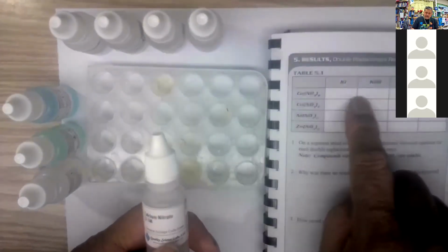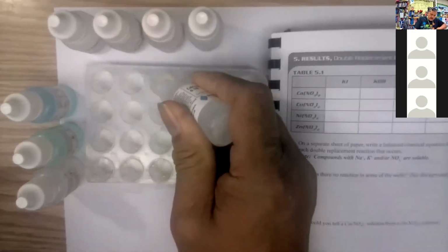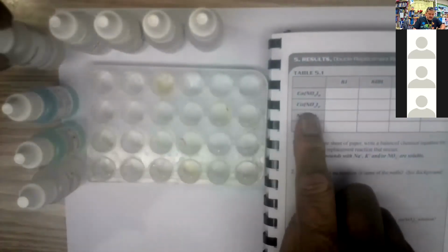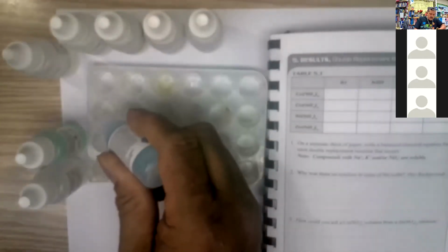All right, so I've got the calcium nitrate. I'm going to put 3 drops going across. Okay, here we go. 1, 2, 3, and so on across the wells. Okay, that's the 3 drops. I got the copper nitrate next, going across in 4 different wells, 3 drops each.